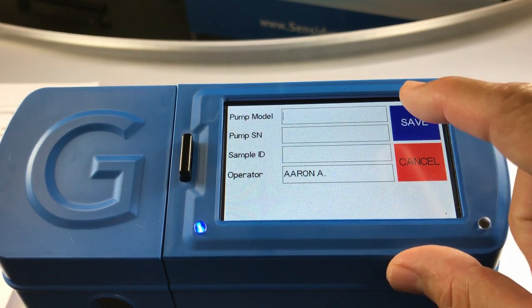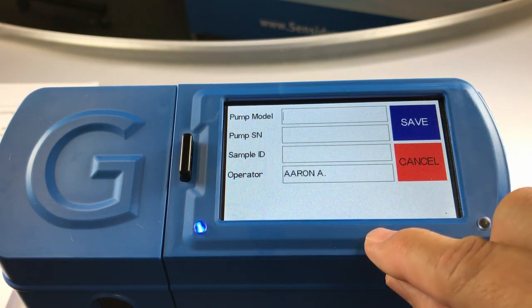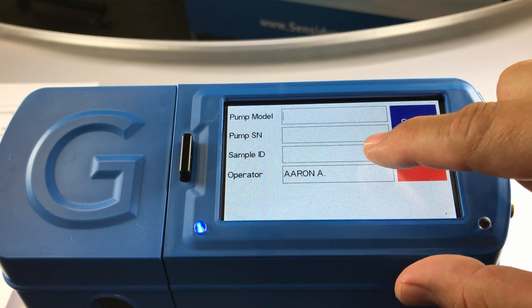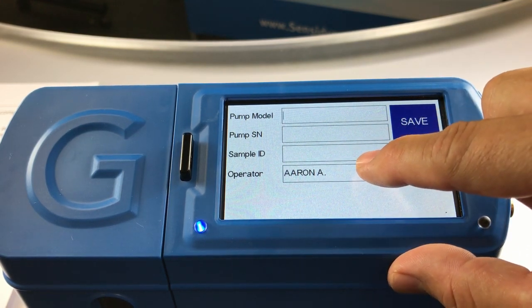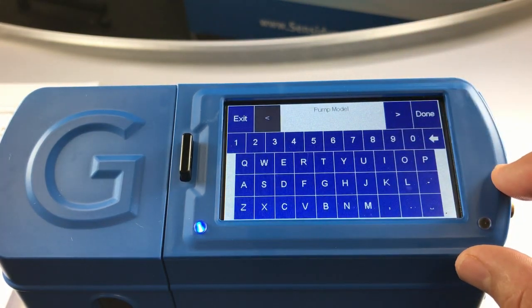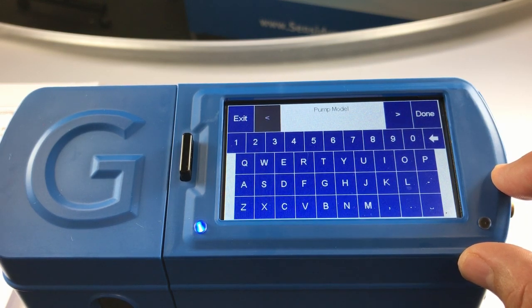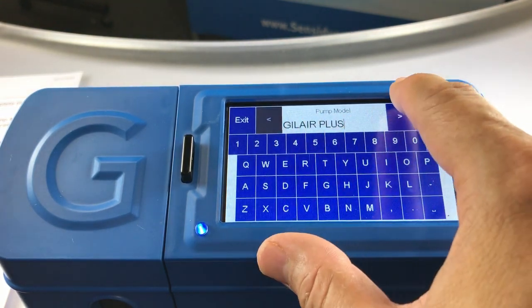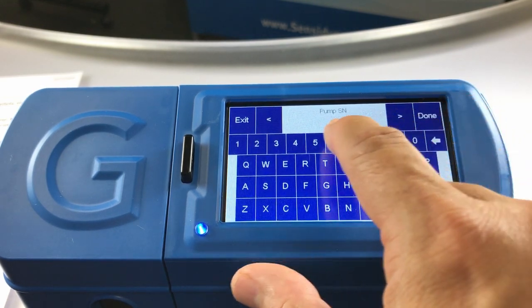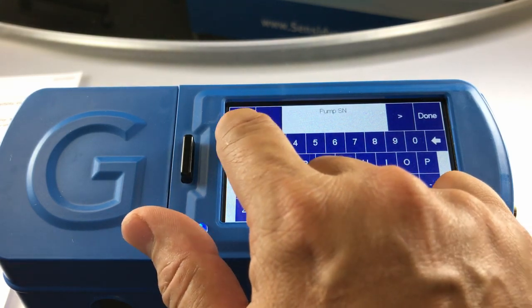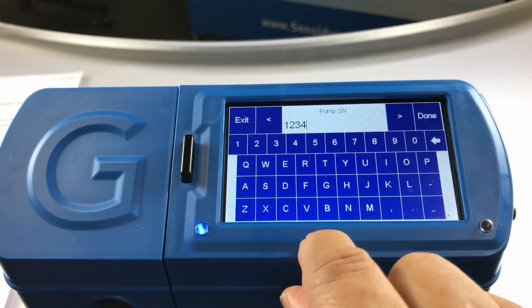Once on the record input screen, complete the record detail information. The record detail contains four fields: the pump model, the pump serial number, the sample identification, and the operator ID. Touch the field adjacent to the label pump model to input the record detail — a keyboard will appear. Enter in the pump or flow source model; ours is the GillAir Plus. Hit the arrow key to advance to the pump serial number. Our GillAir Plus serial number is 1234 for this demonstration.